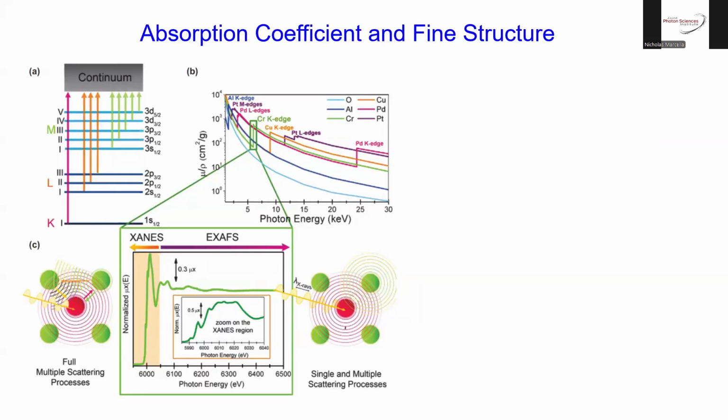And in more scientific language, the electrons may come from different shells. Electrons may come from K or L shells, 1s or 2s or 2p, and that really is defined by the source, the X-ray beamline, which can reach a certain energy or not, based on the energy available to the monochromator. And so by that we are tuning the energy to a specific absorber electron level, and then by crossing the ionization energy and continuing above, we excite the electron into the delocalized state where it can travel between the atoms, and the interference will affect how the absorption coefficient behaves.